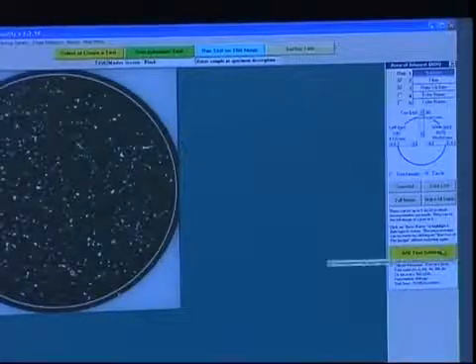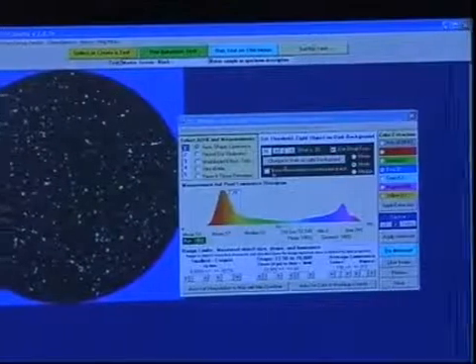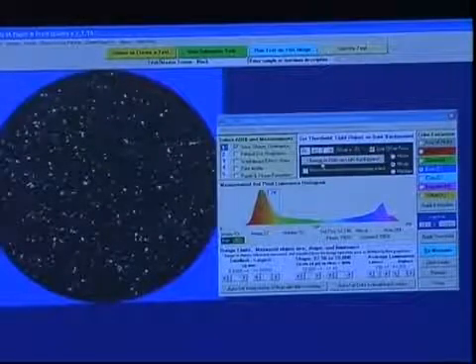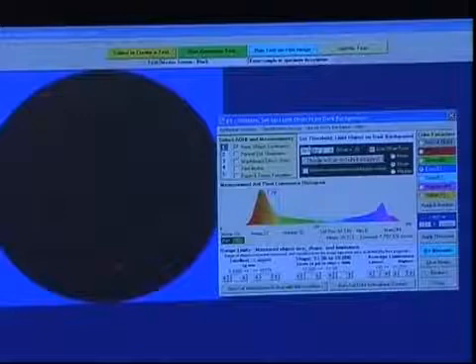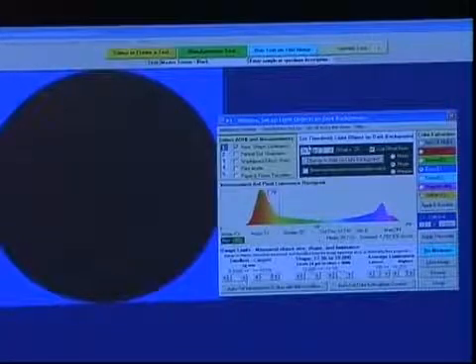So we'll set up the first one, stickies. Here you see that we're measuring now light objects against a dark background. It's very simple to change back and forth between the two. And you can go either way. This happens to be a black hand sheet.